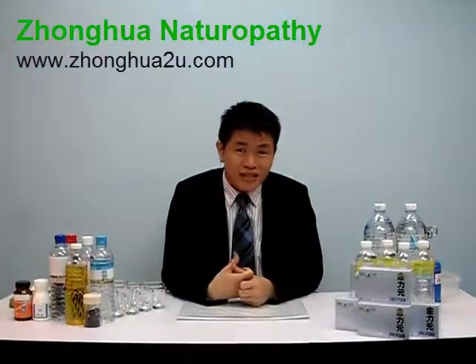In this video demo, I'm going to show you the difference between the pH of different kinds of normal drinking water in our daily life. Why do we have to find the pH of our drinking water? Because we all know that most of the modern diseases, such as diabetes, hypertension, and the serious one, cancer, are closely related to acids. So we have to find ways to get the acid out from the body.